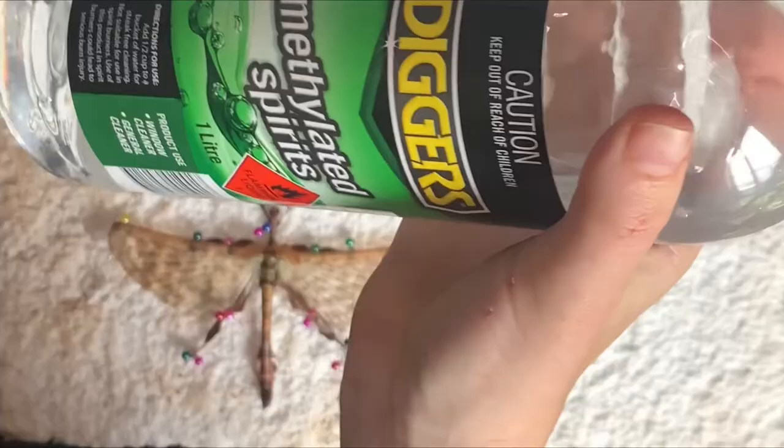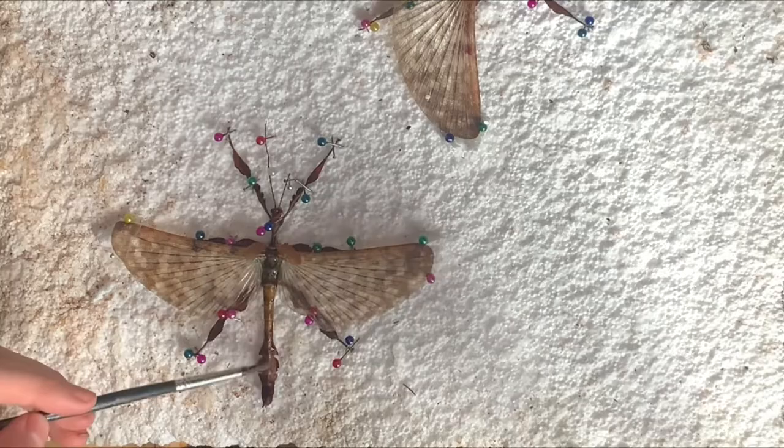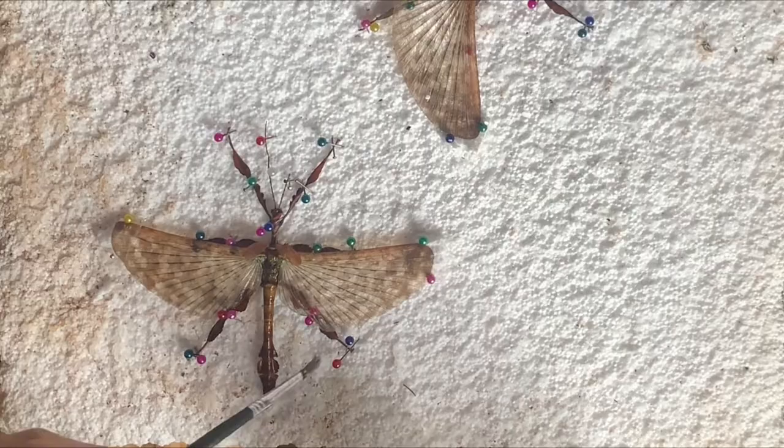To preserve the insect, take your methylated spirits and gently paint a layer over the entire invertebrate. Methylated spirits helps keep the natural colour of the phasmid — without it, your specimen may turn black. Once preserved, place your pinned insect somewhere safe to fully dry.